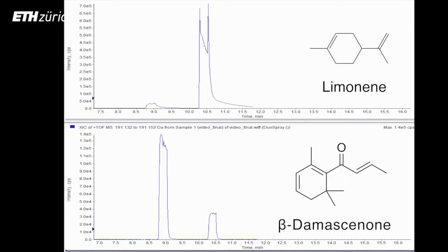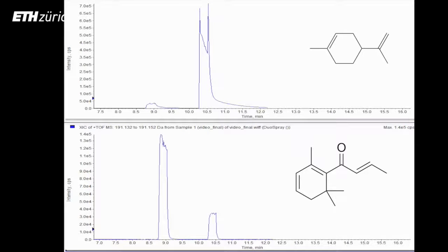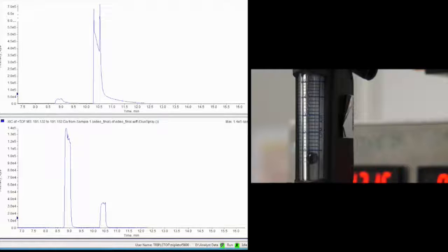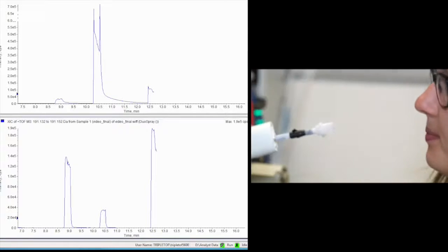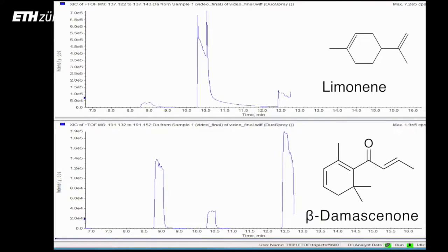Each compound is dominantly present in the breath from the person who consumed one specific juice. Beta-damascenone is more dominant in apple juice and limonene more dominant in orange juice, respectively. So let's analyze Nora's breath to find out what she drank. Please, Nora, exhale into the mass spec. We can now see the time traces from the specific compounds. And yes, we can recognize on the beta-damascenone trace a more relevant signal.